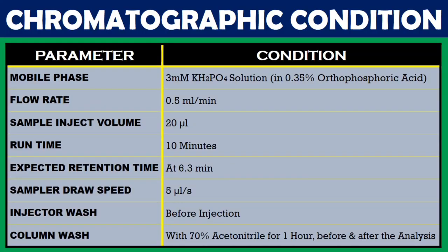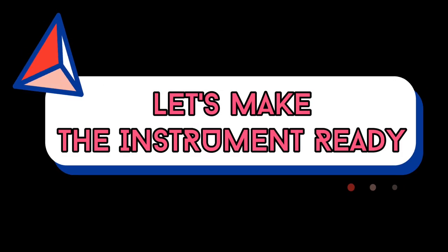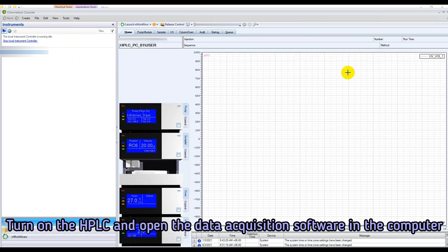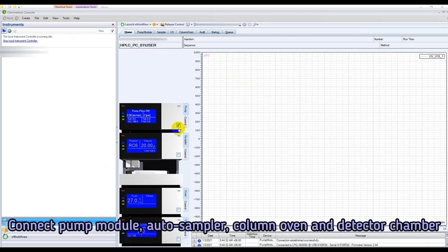Chromatographic conditions are shown in the display. We must ensure these conditions before the analysis of vitamin C. Let's make the instrument ready. Turn on the HPLC instrument and open the data acquisition software in the computer. Connect pump module, auto sampler, column oven, and detector chamber.